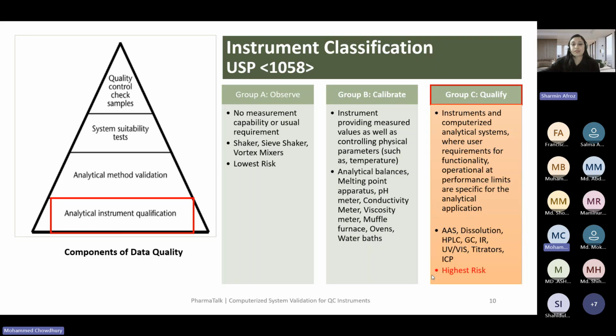Okay, Rehan. Thank you, Sharmin. Mr. Abdullah, any more questions from you? Yes, thank you for the opportunity. I just want to add a few things to my previous questions. If the software I'm using is not related to any instrument or measurement, like in our lab we use PLA software, a parallel line assay, we perform the statistical analysis or potency measurement through the software.